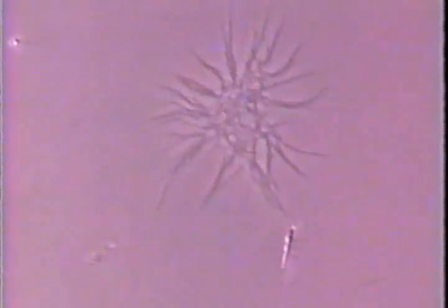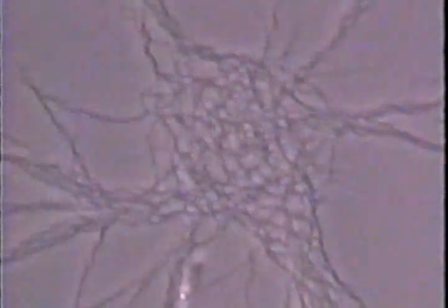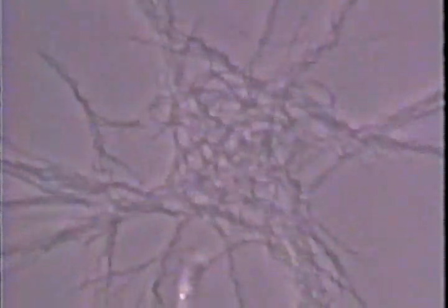A cluster of Borrelia burgdorferi spirochetes from culture by phase contrast microscopy. The same culture cluster in higher power showing the intertwined spirochetes. A single spirochete showing the flagellar tail. This is in transitional movement in a fluid medium.